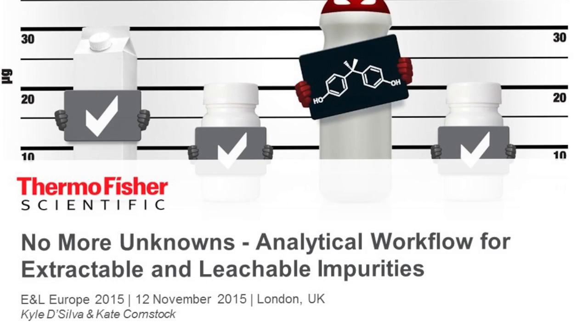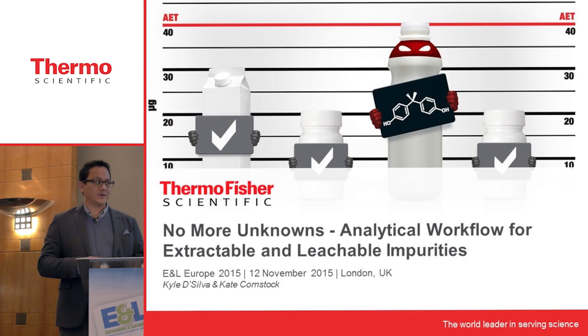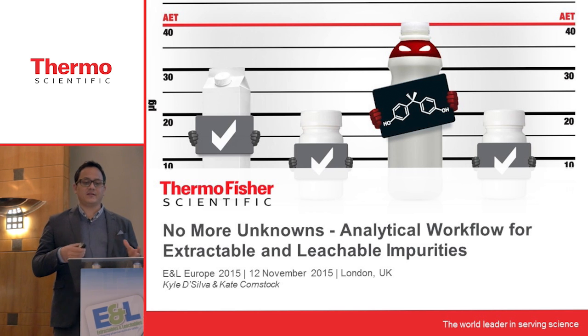A slightly provocative title, No More Unknowns. What we are going to be presenting to you today is some new technologies and workflows that have never before been used for extractable and leachable analysis that we believe can give greater insight into the identification of unknowns in very simple workflows.